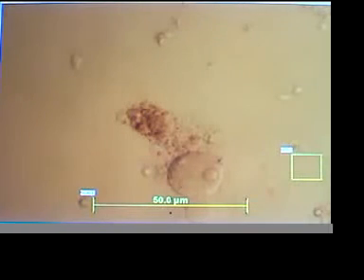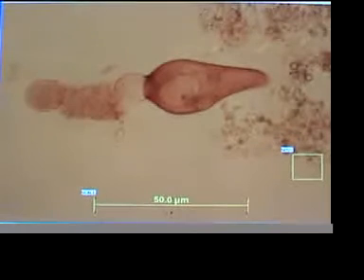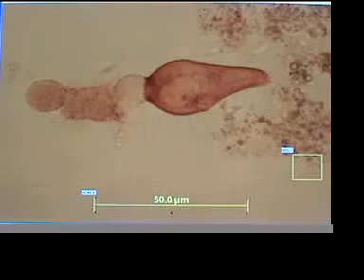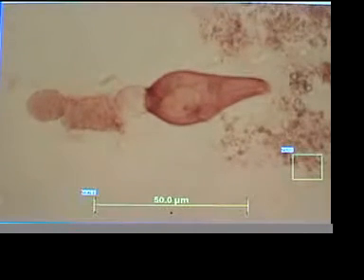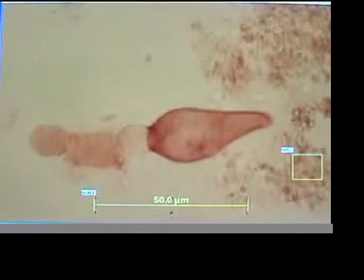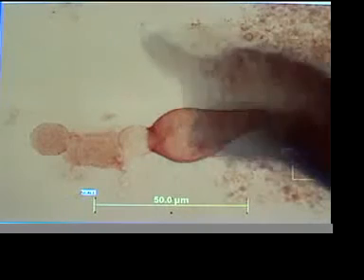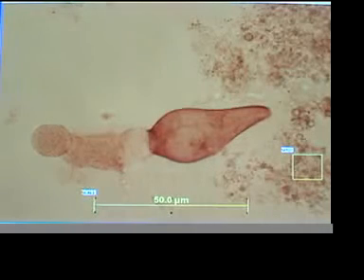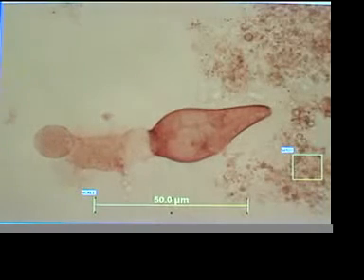We're not really sure what's causing the effect, some kind of resonance effect. Another hit. Devitalization. Let's see if we can get a little center of the picture. Hey, you see this tiny organism swimming just off the picture. This is 929 hertz.